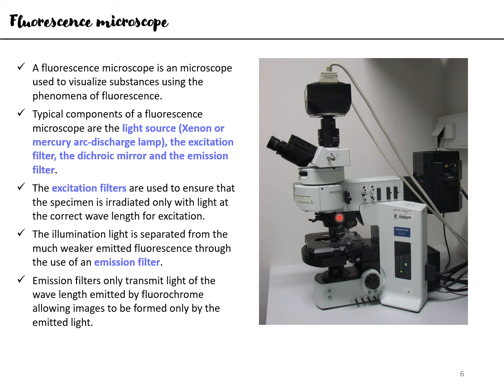So apparently it might look like an inverted microscope. We have talked about inverted microscopes in depth in one of my previous lectures on mammalian cell culture and the different techniques used in mammalian cell culture, but it is quite different. How so? In an inverted microscope, the source of light is typically on top. In an epifluorescence microscope, also, the source of light is on top.